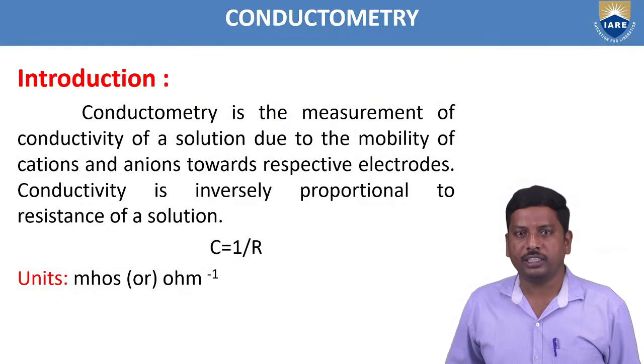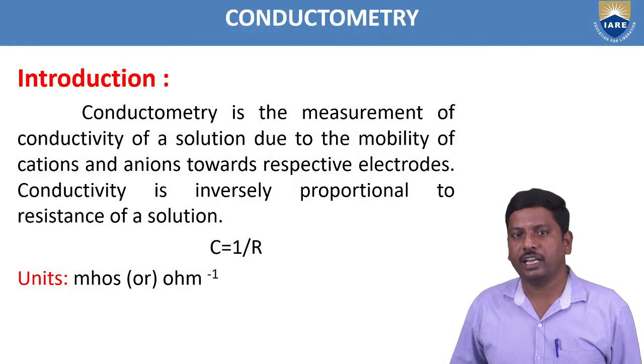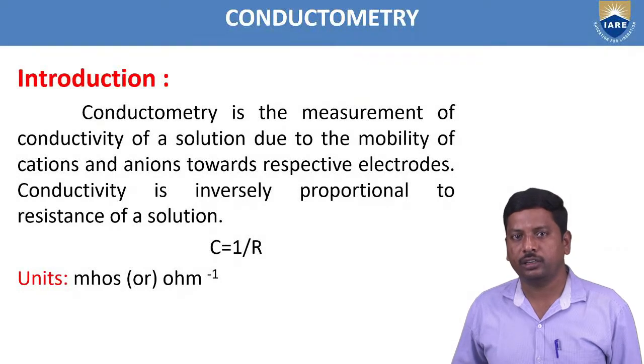First of all, what is conductometry? Conductometry is used to determine the endpoint of reactions like neutralization and precipitation reactions. That means the endpoint of a reaction is determined with the help of conductivity measurement, and that is a conductometric titration. In the classical methods of analysis, the titration involves the titrate and the titrant, and determining the endpoint of a reaction is the classical method of analysis.